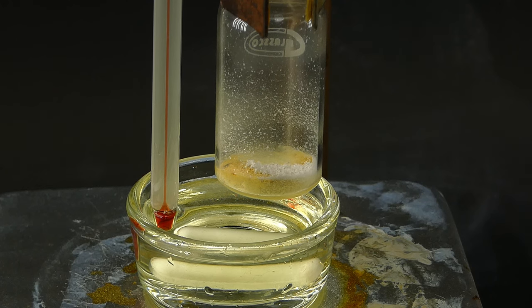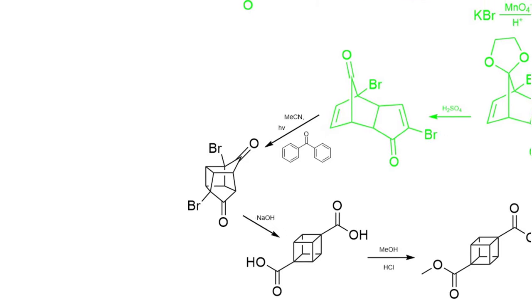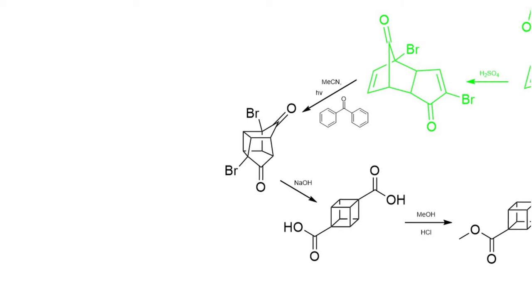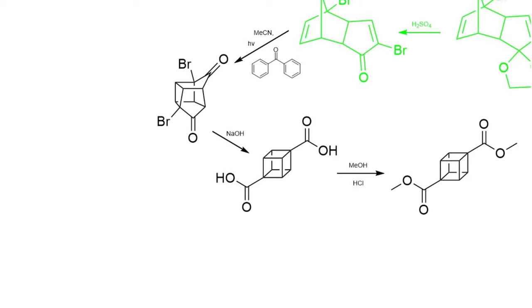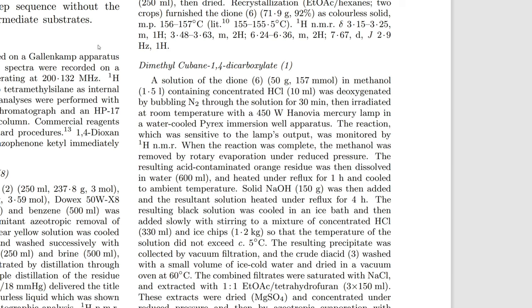Now with the diketone ready, I can start what probably is the most feared reaction in this whole synthesis — the photocatalyzed [2+2] cycloaddition. It will turn my diketone into a weird cage-like compound, which will then be just one step away from the cubane. It doesn't require any additional reagents; all that has to happen is these two double bonds on the ends of the diketone react together, closing the structure.